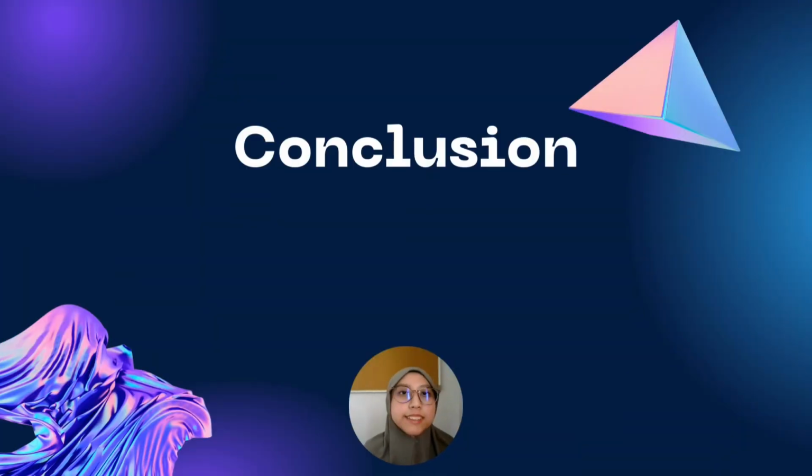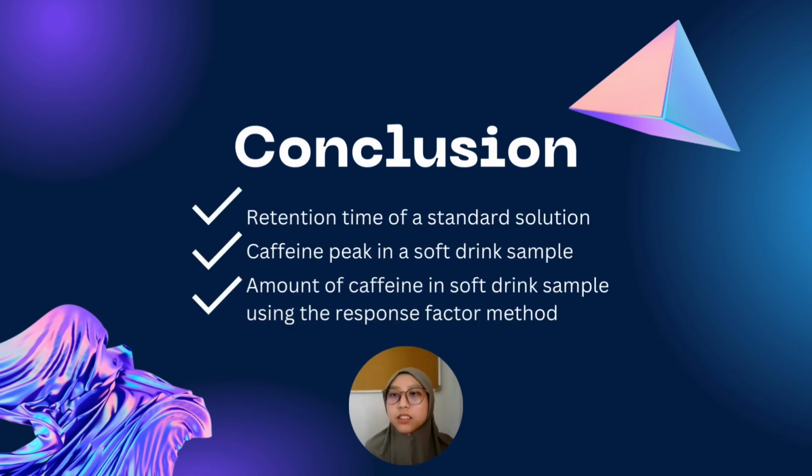To conclude this experiment, we achieved all our objectives with great success, as we were able to obtain the retention time of a standard solution, the caffeine peak in a soft drink sample, and the amount of caffeine in the soft drink sample using the response factor method.